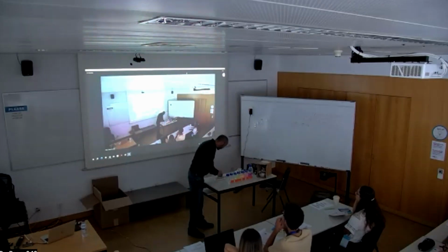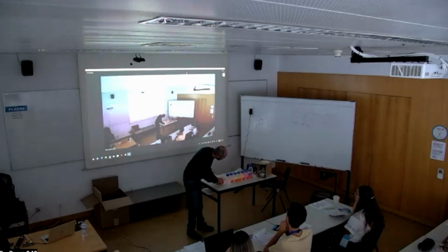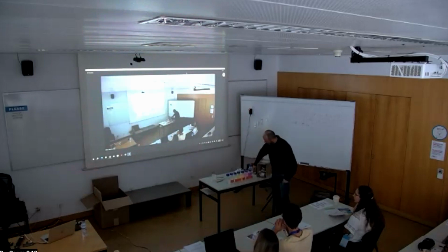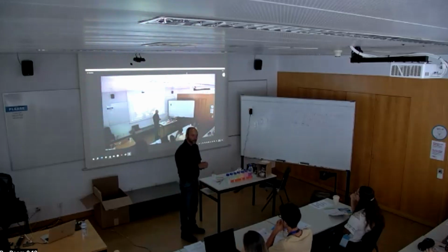And the last one of all of them is the red light, 636. And what will happen? Is 630 this one? There should be a response on the last one because it's approximately 600. Okay, so that one. We cannot excite all the previous ones, even if I do it from the other side, so it doesn't matter. The others don't react at all. So zero. This is also a demonstration of the particle nature of light, but this is another story.